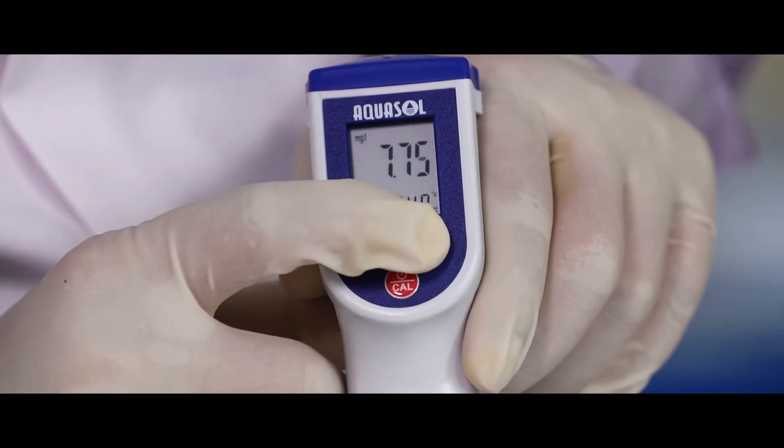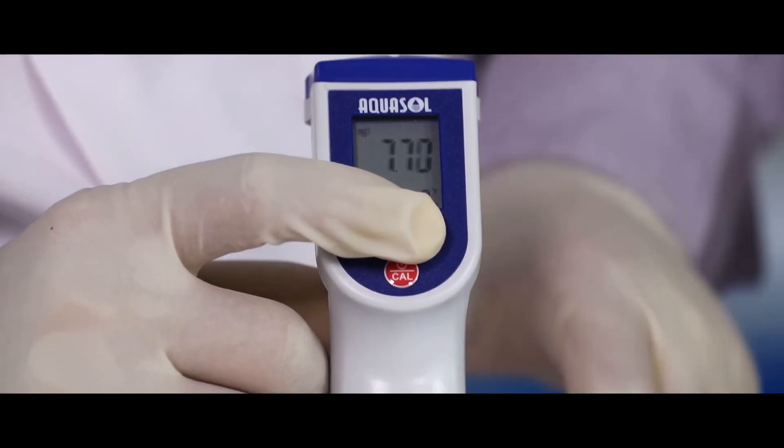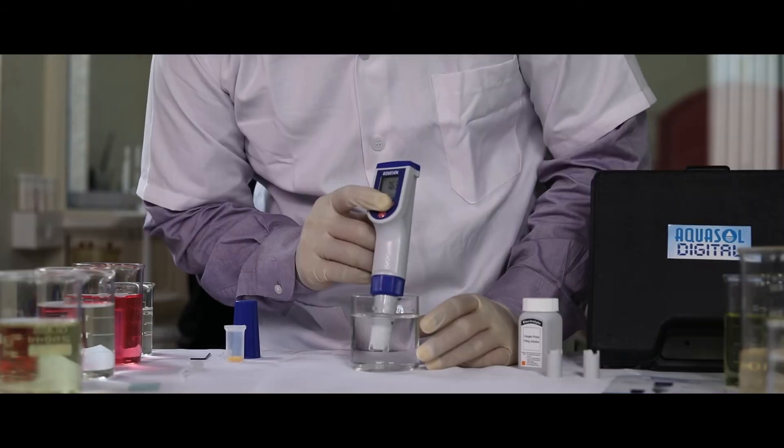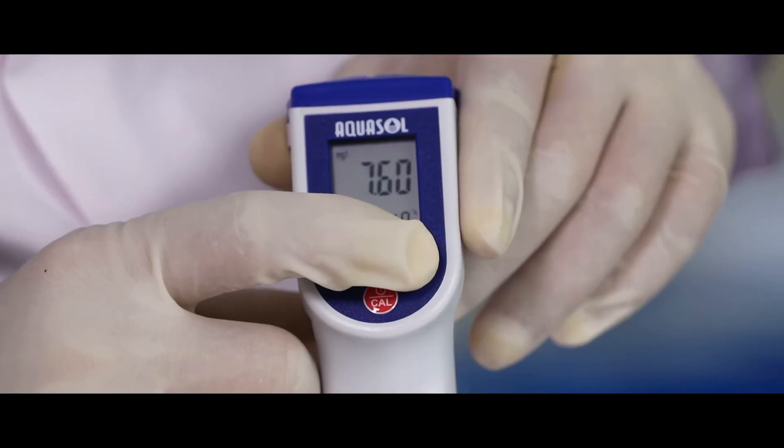Press MODE to find the dissolved oxygen of the sample in different values like mg per liter, percentage, and ppm.